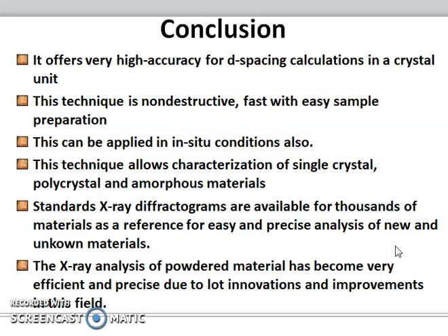If the fibers are displaced from each other, the orientation diffractogram will get too many disturbances, and sometimes it becomes difficult to identify. So fibers should be parallel, they should not be overlapped, but they should remain in the form of a film, not in the form of a fabric.